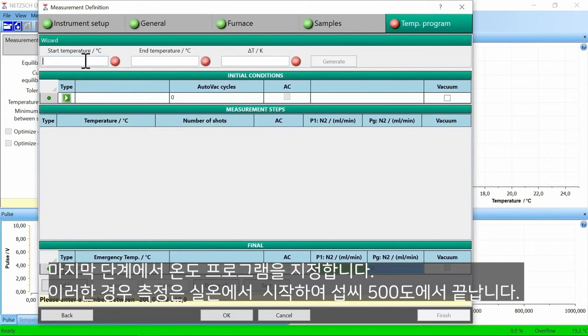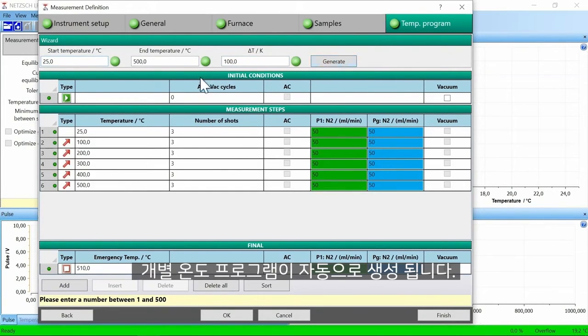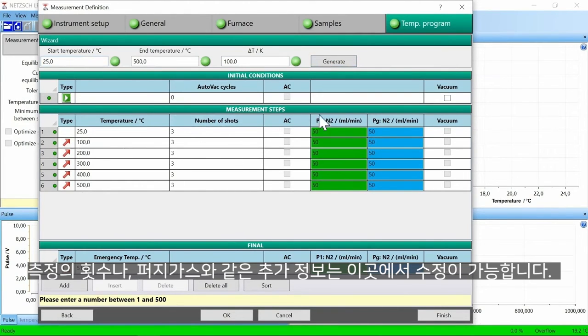In the last step, the temperature program is defined. In this case, the measurement starts at room temperature and ends at 500 degrees Celsius with 100 Kelvin steps in between. The temperature program is generated automatically. Additional information like number of shots and the purge gas can be modified here.